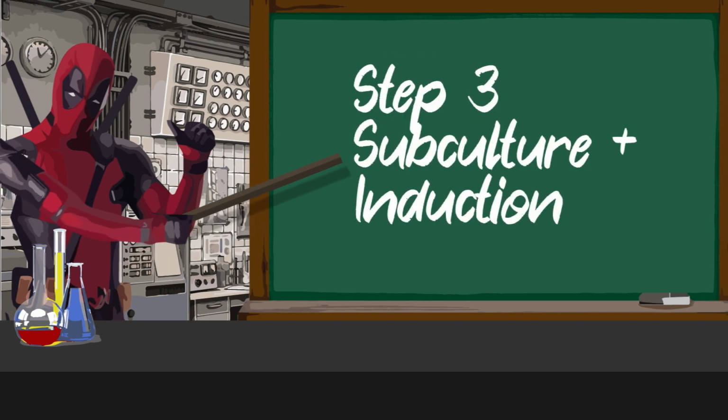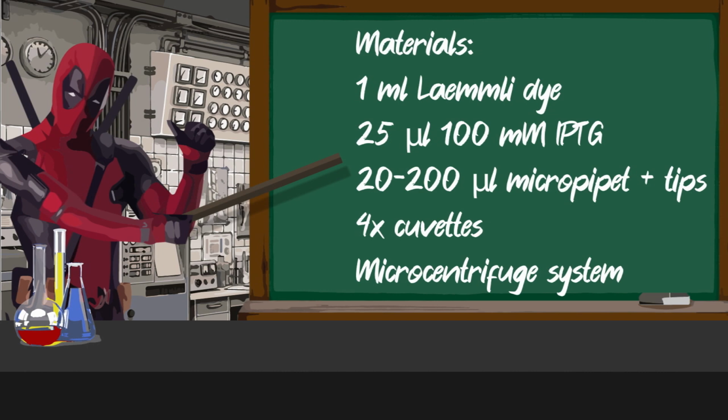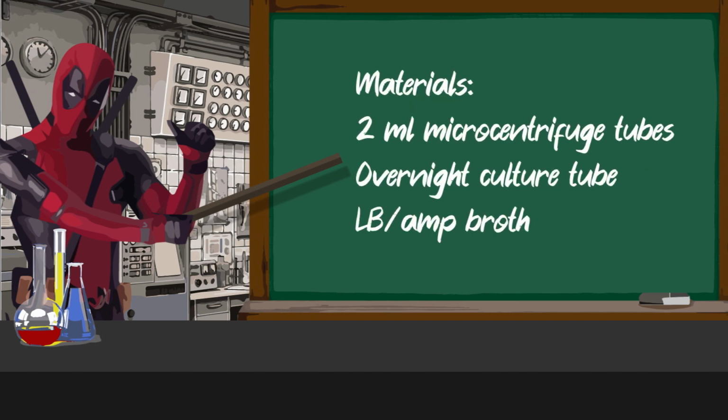The third step to this experiment is subculture and induction. The objective is growing bacterial culture, inducing expression, and harvesting proteins. The materials needed for this are the Laemmli dye, IPTG, the microcentrifuge and its tubes, the overnight culture, the LB, and ampicillin.